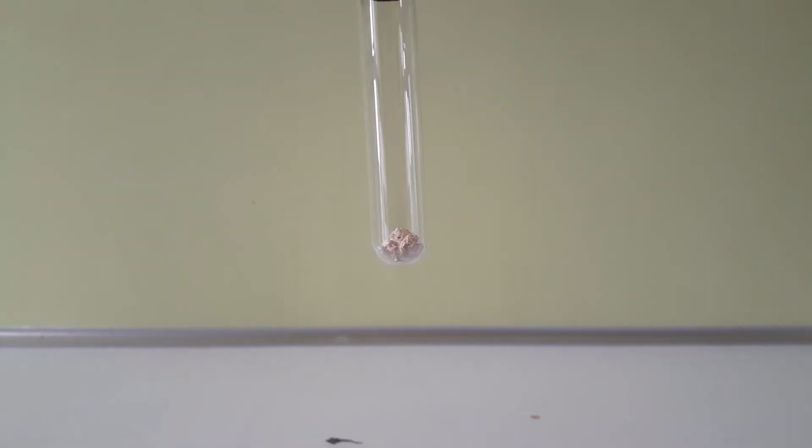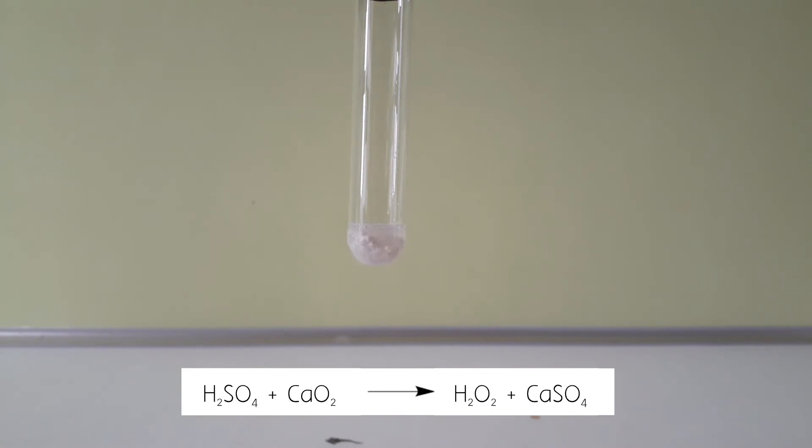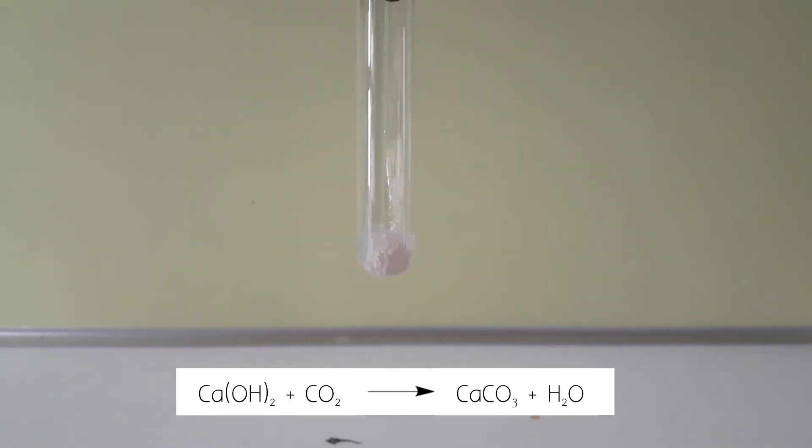Now for the test for peroxides, I add some of the material to a test tube and then add sulfuric acid to it. This should generate hydrogen peroxide and calcium sulfate. You can see immediate bubbling of the solution, and this could also be contributed to some calcium carbonate which was generated during drying in air by the reaction of calcium hydroxide and CO2 gas.